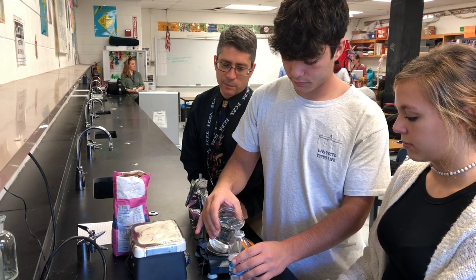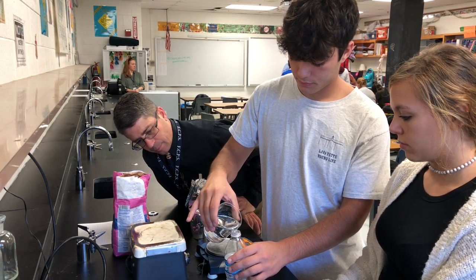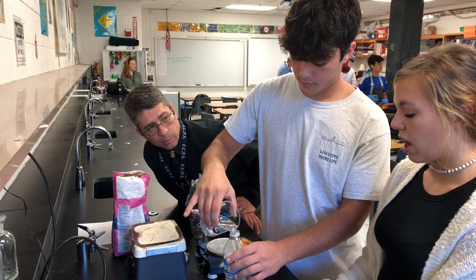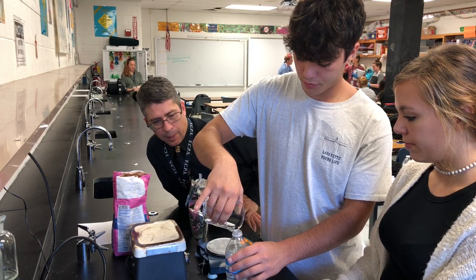Yeah, don't spill it. So there's yeast in here, sugar in here, and water. Is there anything else? Root extract. There will be. That's that over there, right? Okay. And besides that, that's it, huh? That's it.